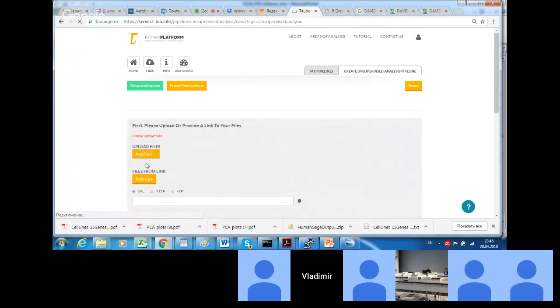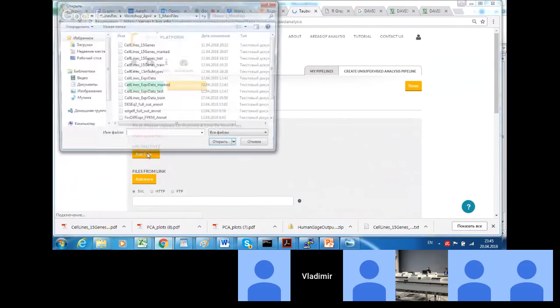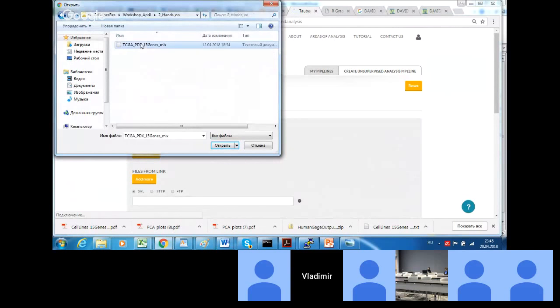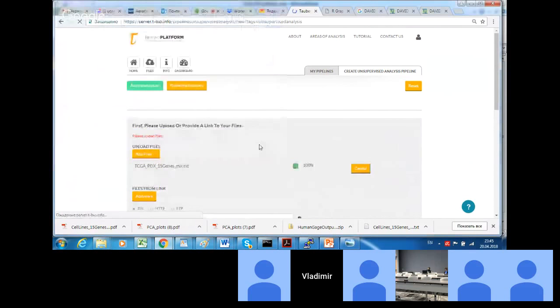I create an unsupervised analysis pipeline. I simply upload the file I'm interested in. I simply take this file out of the hands-on folder.